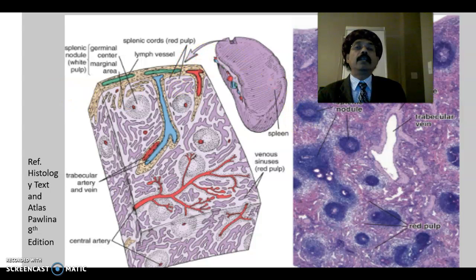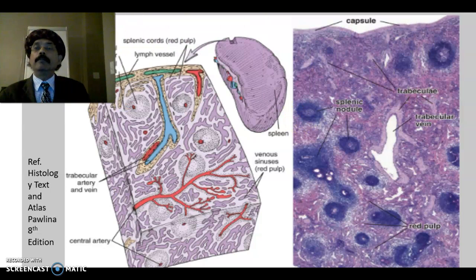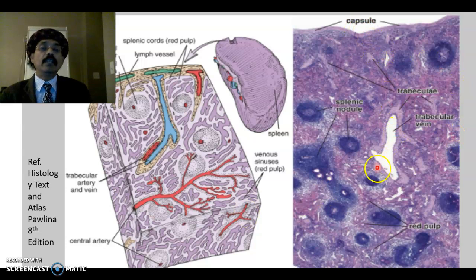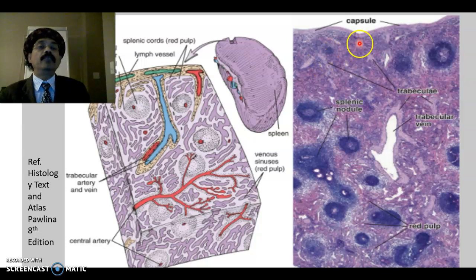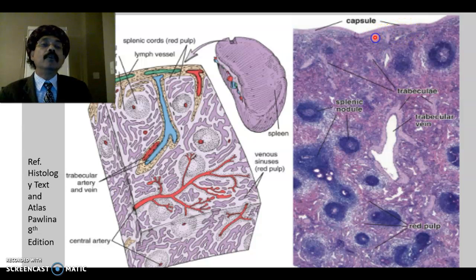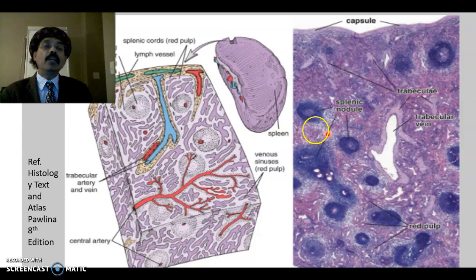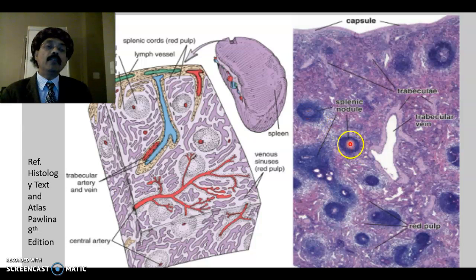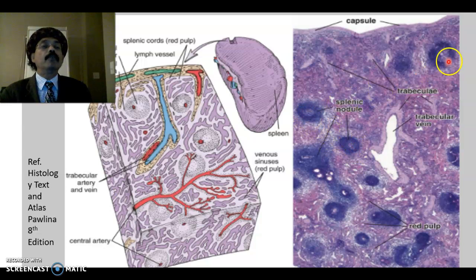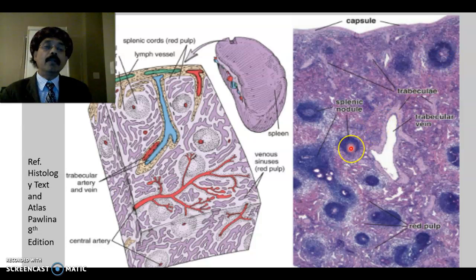Here is a photomicrograph of the spleen, as seen under the light microscope with low magnification. This is the capsule. We have the trabeculae here, and the trabeculae contain blood vessels — the trabecular vein and the trabecular artery. These are the splenic nodules, and the splenic nodules have a germinal center inside, which is the site of formation of lymphocytes.